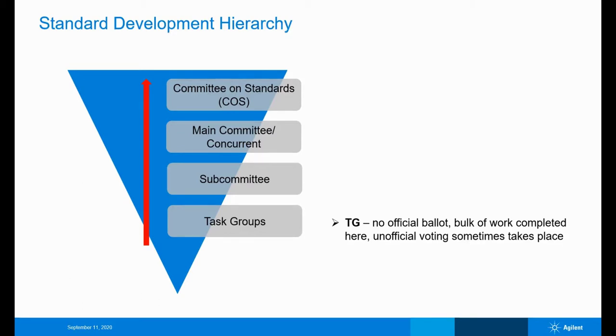And then the draft document is circulated within the task group expert panel, who then agrees on a final draft, which is used to perform a pilot study based on ASTM D6300 criteria.